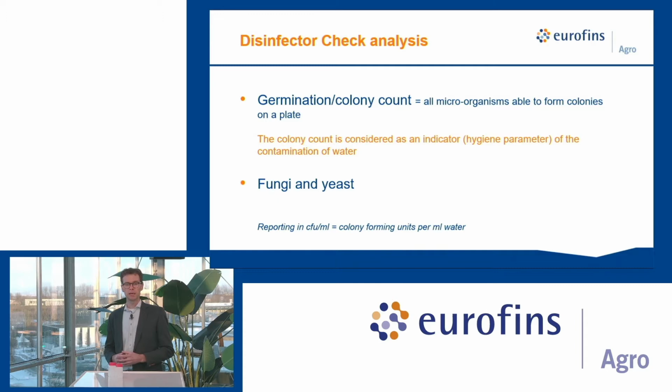Another parameter we analyze is the fungi. And we can also analyze the yeast on a specific growing media. The reporting is in colony forming units per milliliter of water.